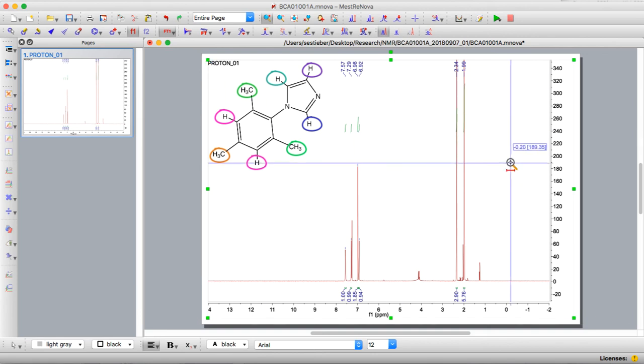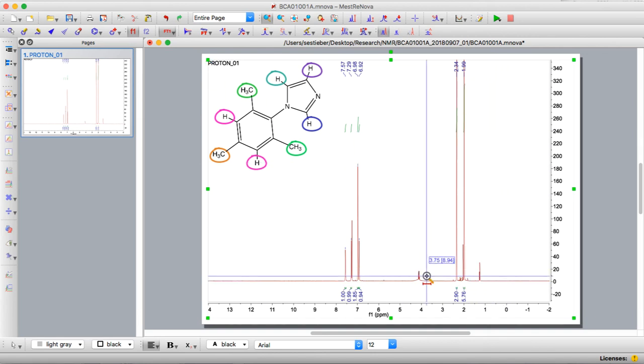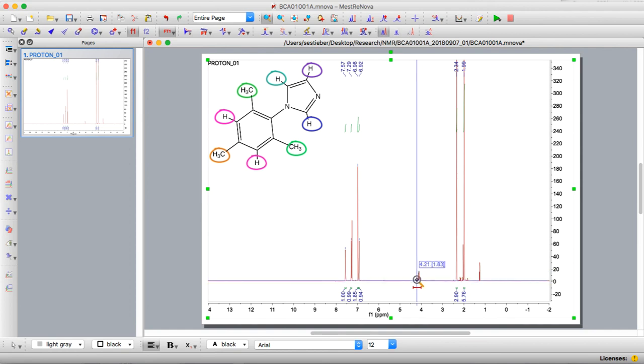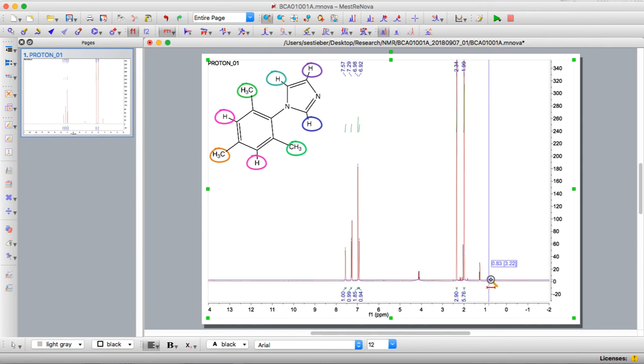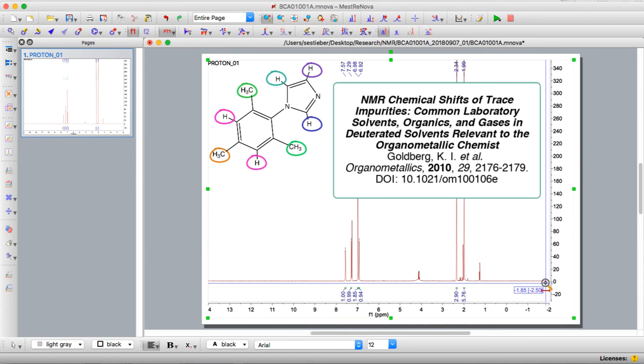The last thing in the spectrum there are a couple smaller components. You can integrate them to convince yourself that they're not significant. Usually you'll have a little bit of residual solvent so there is one particularly good publication that actually references all common solvents in NMR deuterated solvents. The reference is given here so anytime you have a spectrum I highly recommend you look at this reference to make sure that you don't have additional solvent signals in your spectrum.